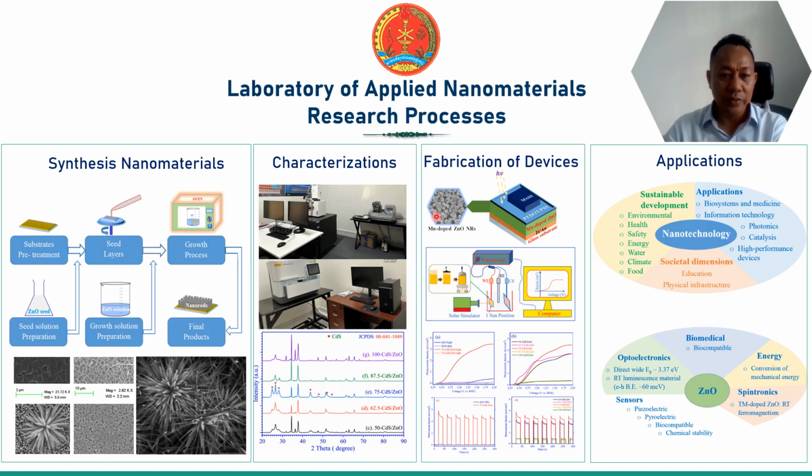So I will show you briefly the research process here. Here is the synthesis of nanomaterials based on low temperature growth techniques. From this technique, we can synthesize nanomaterials in different structures, including nanowires, nanoflowers, nanoporous, nanodisc, and nanobell. Many different types of nanostructures come from that technique.